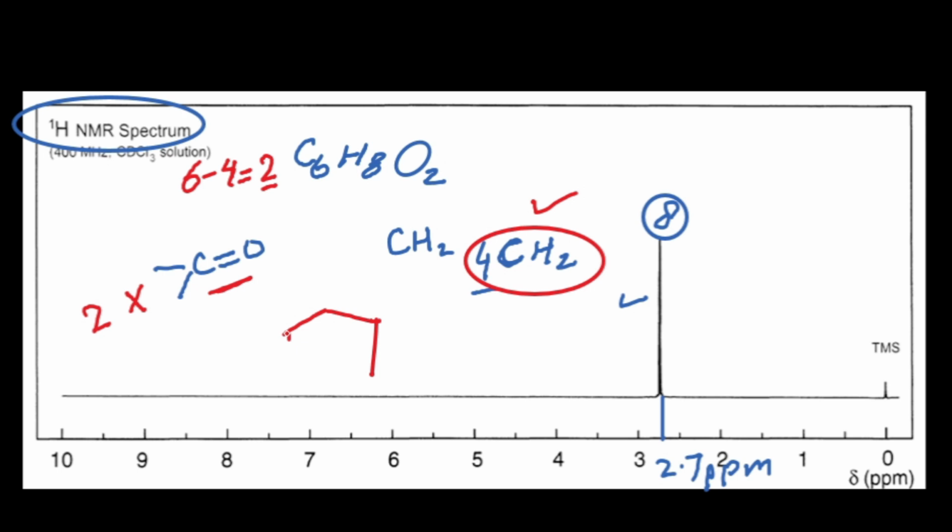Okay, if I say that one carbon is attached here with the oxygen by forming a double bond, so here now one carbon, one CH2 group, one, two, second, third and fourth. So it means here it should be attached with the other oxygen atom.